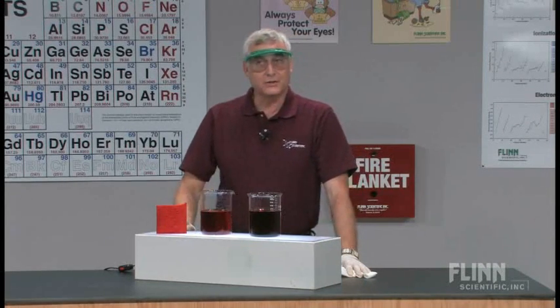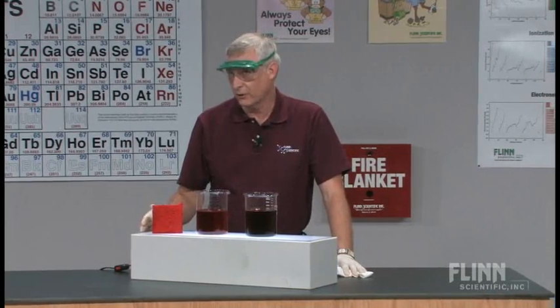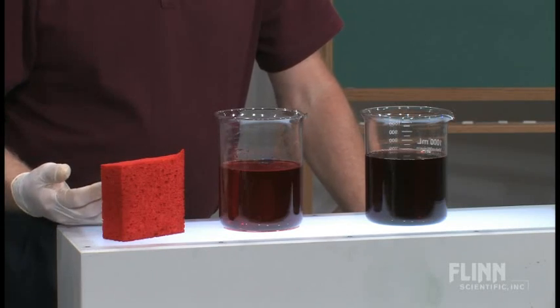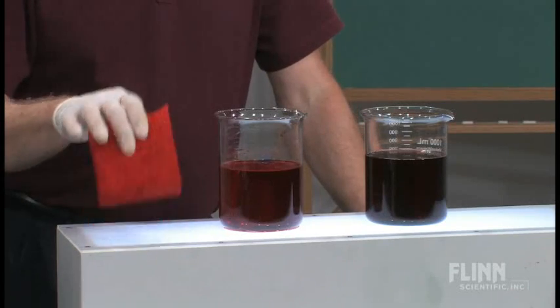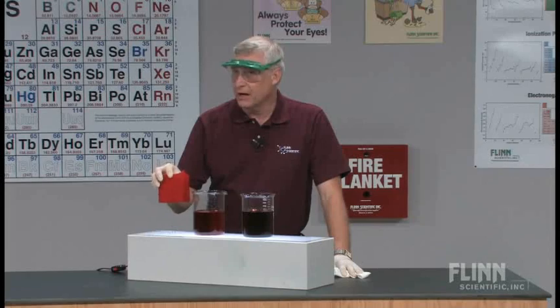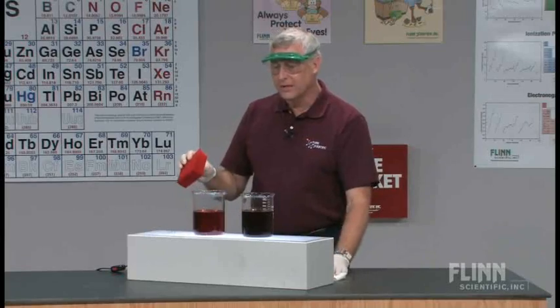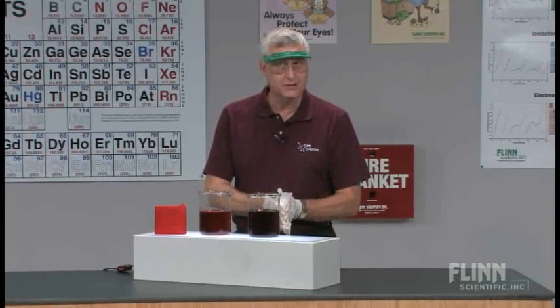Another way that you can use this is, again, with a parent night or an open house night, or perhaps you're doing a science show for an elementary school. And this is a real colorful and a very easy demonstration that you can do. You don't have to explain the theory behind it. You can just simply tell them that these are acids and bases and that they're doing some color changes. So they would expect the red sponge in red solution to be red in color, but when it changes to blue, that really throws them a loop and then goes back the other direction. This sponge can be used a number of times in that form. Obviously, the cellulose at some point begins to degrade.